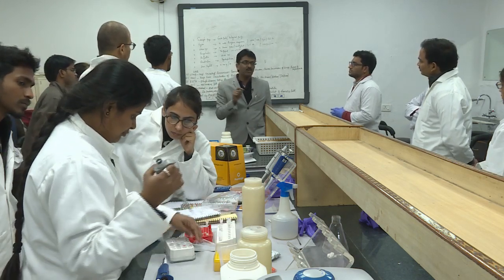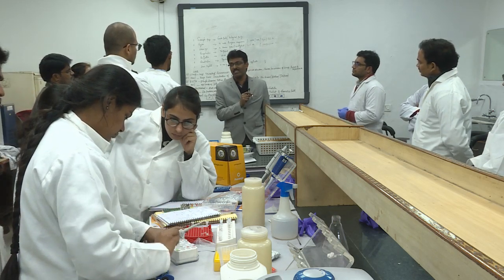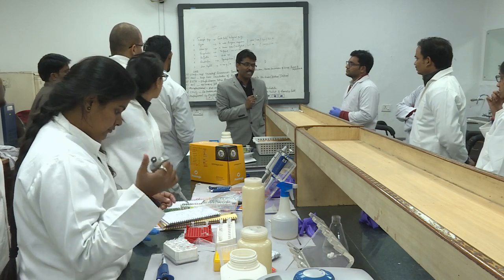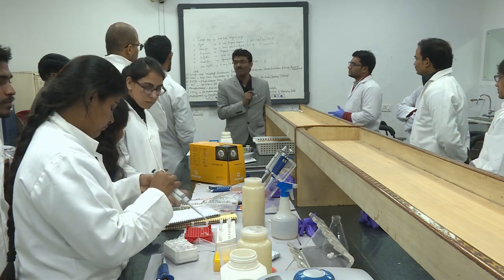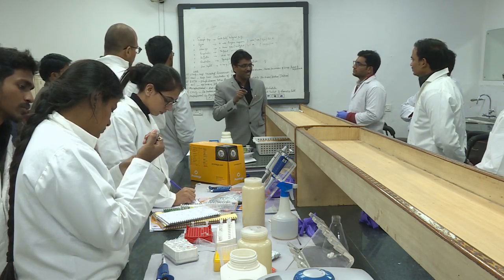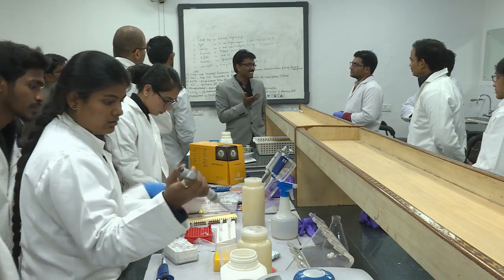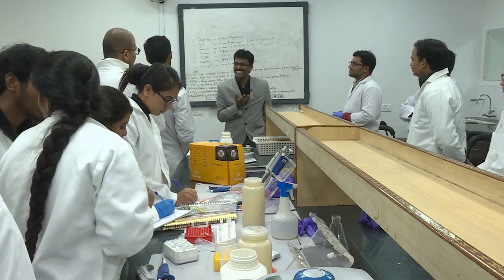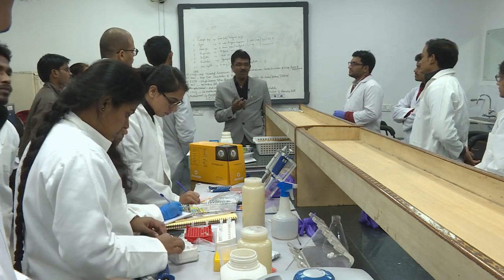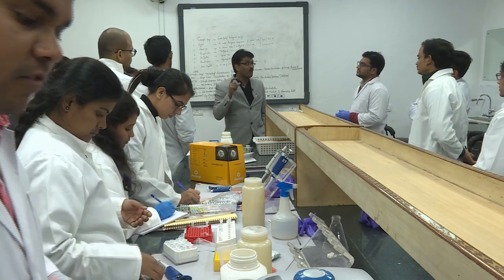Okay. For spore, it is slightly difficult because the spores have to be ground thoroughly using very strong abrasives. That is what we use, a sterile glass powder, right. Remember, glass powders are made in the laboratory. You take any broken petri plate or some flask, you just grind it in pestle mortar. After 1 or 2 hours, you get a glass powder. It is not purchased, it is made in the lab. You put it in autoclave, 2 times you do sterilization, the sterile glass powder is always there.